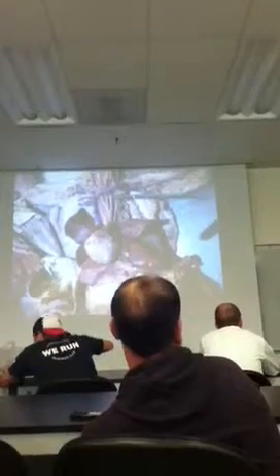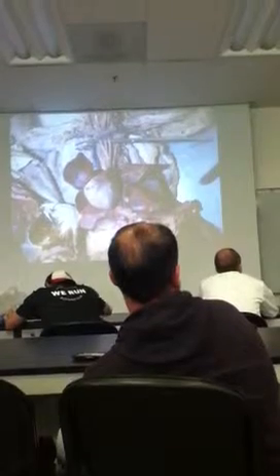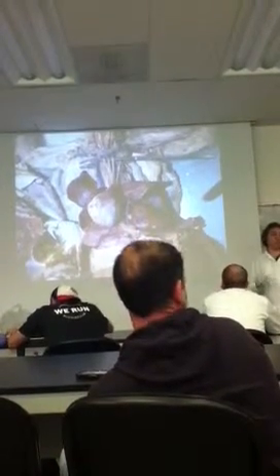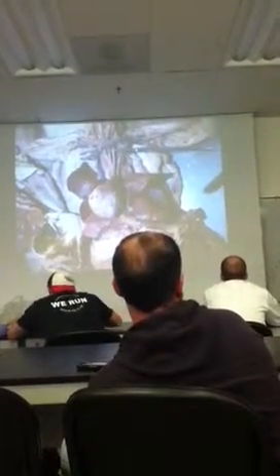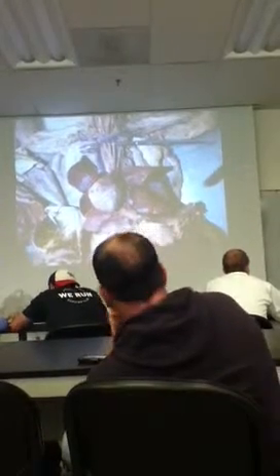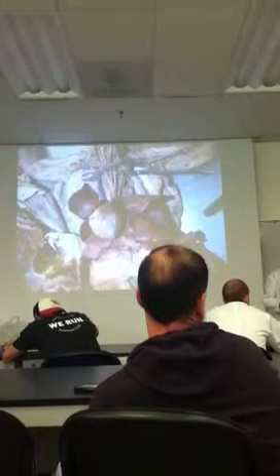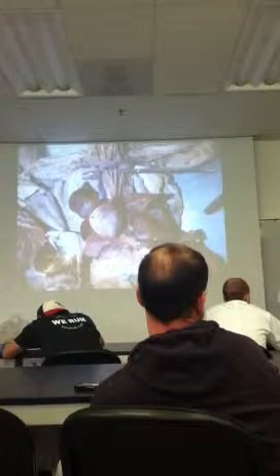Alright? If you don't have a good coloration in your cats, let me know. We cannot do much about that, but I can tell you what to do. These are a few cats left from the previous semester, but if you don't have a good coloration, you can go over to the other groups and see them. You can come here and see I put two other cats here where I put all the digestive system and all the other viscera away from them, so that you can see all the vessels here.